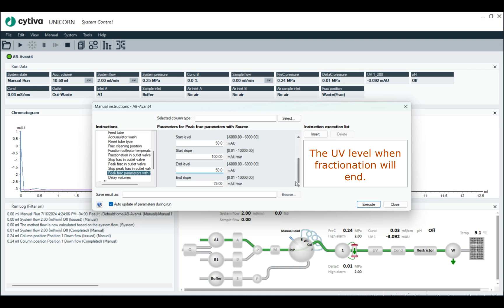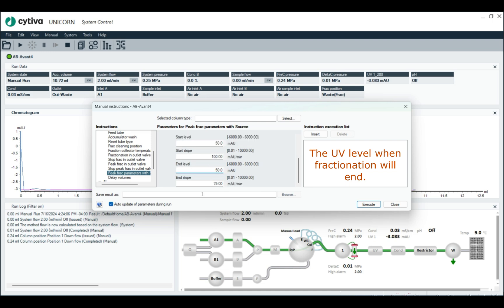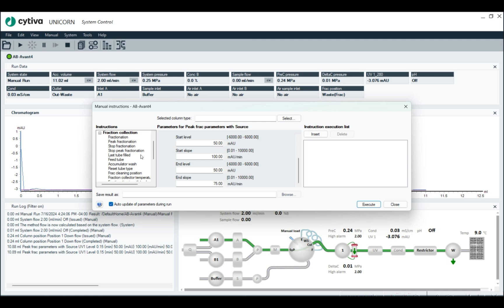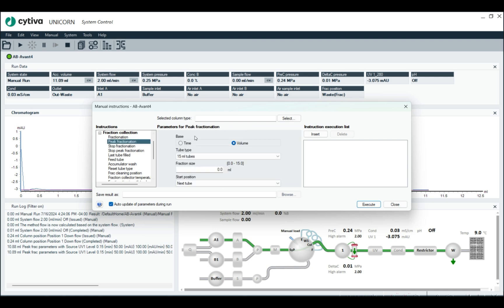I would recommend making the end level either the same as the start level or lower. All right. And then we're going to hit execute, but that's not enough. We still have to type in peak fractionation.